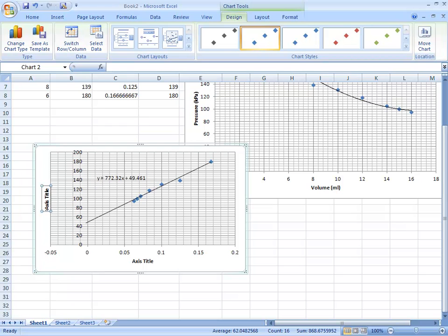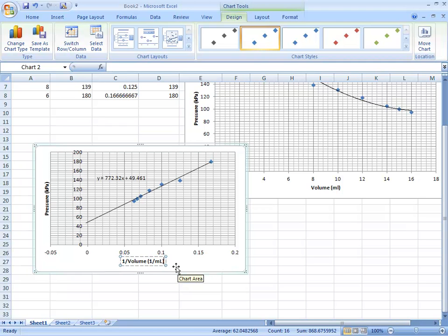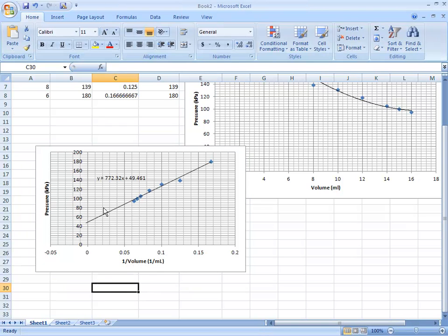So these are the graphs we're going to print first to look at. The y-axis is pressure in KPA, and the x-axis should be labeled 1 over volume, in units of 1 over milliliters. These are the two graphs you're going to want to print.